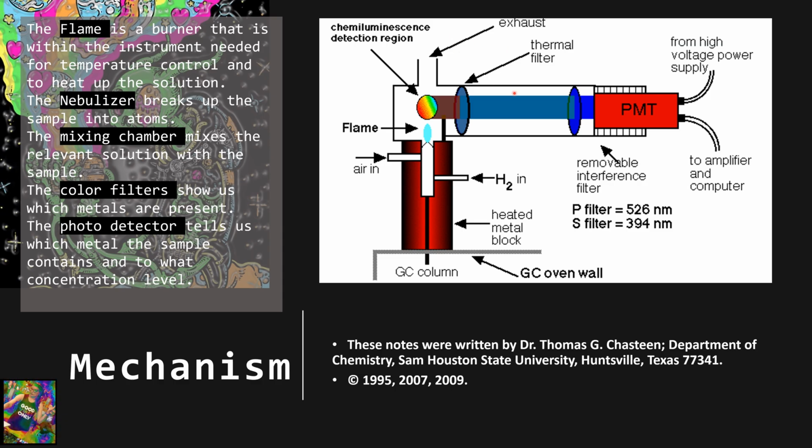Now, I will be summarizing the process that occurs during a flame photometer analysis. I believe you already heard these terms, but I will repeat them for the sake of FPD. Desolvation involves drying a sample in a solution. The metal particles in the solvent are dehydrated by the flame and the solvent is evaporated. Evaporation: the metal particles in the sample are also dehydrated, which also leads to evaporation of the solvent. Atomization is the separation of all atoms in a chemical substance.